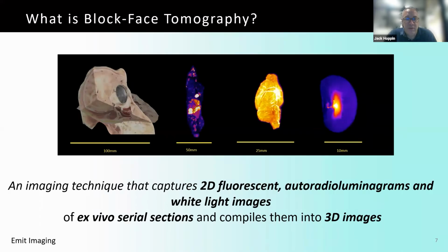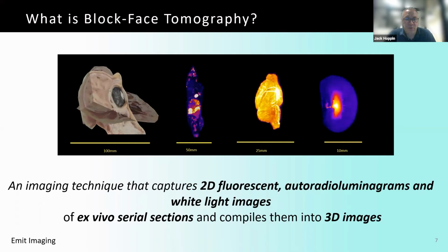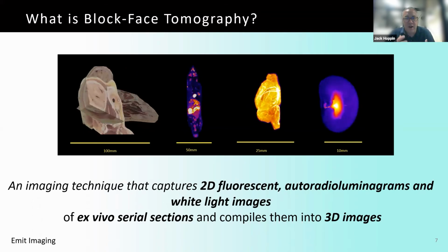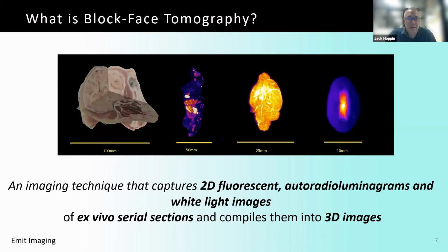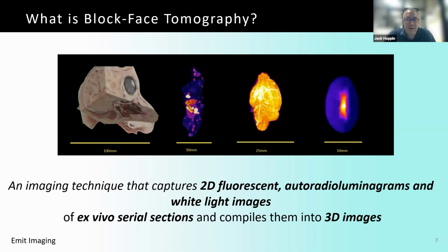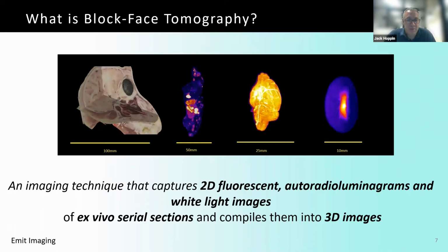The first image on the left is a 3-dimensional image of a cynomolgus head. This is 5 years old. It's one of the first times we tried taking images off the block face and then reconstructing them in 3 dimensions. It was a hack of a cryomacrotome at the time, and it's actually a bit harder than you think. There's more movement. That image itself was 1800 by 1800 by 1800 40-micron isotropic voxels. That's part of the reason we were able to do it: we had the computational power. That's a lot of computational power with a red, green, and blue channel.